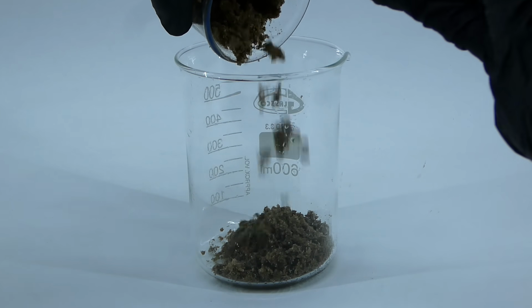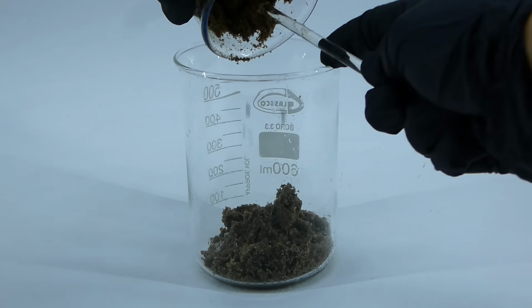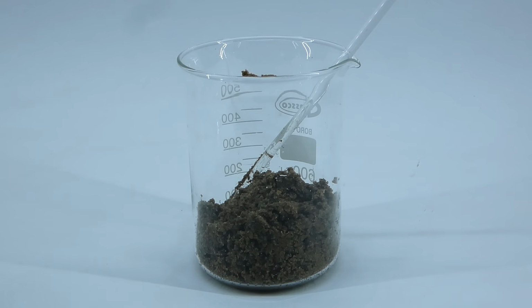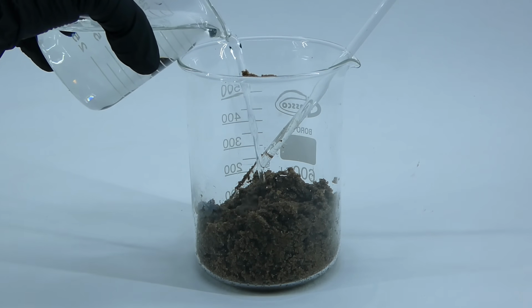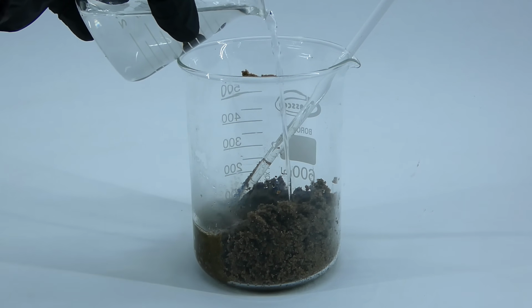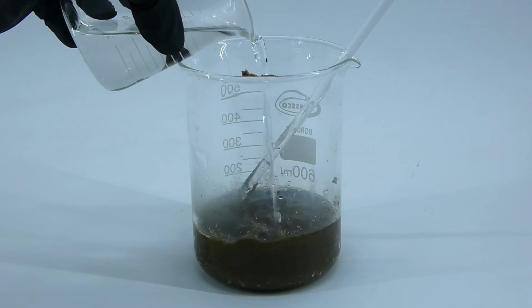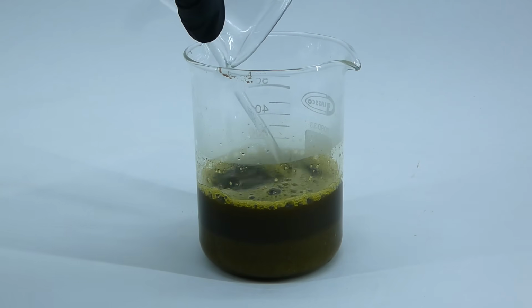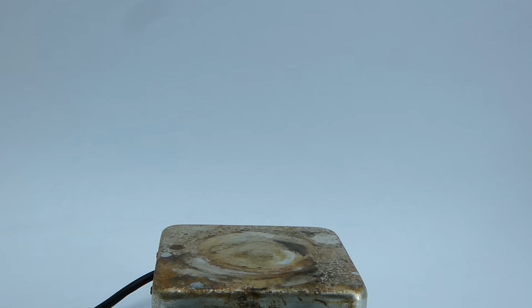The thing is that lots of them don't dissolve in water, and to dissolve them, I need to use some concentrated hydrochloric acid, which will leave the sand behind and destroy everything else. I poured 100 ml of 30% hydrochloric acid onto the sand, and it immediately started to react and made the whole mixture turn a green color. I then added another 50 ml of the acid for good measure and placed the whole reaction mix on a hot plate.